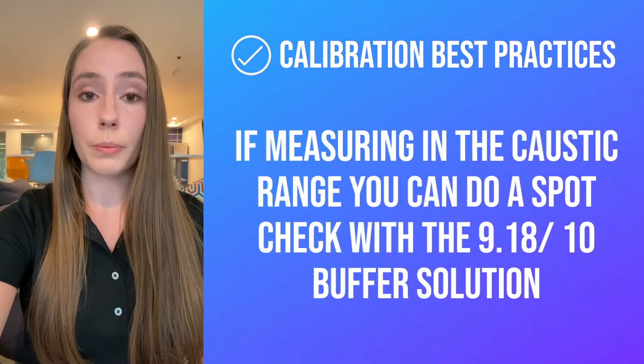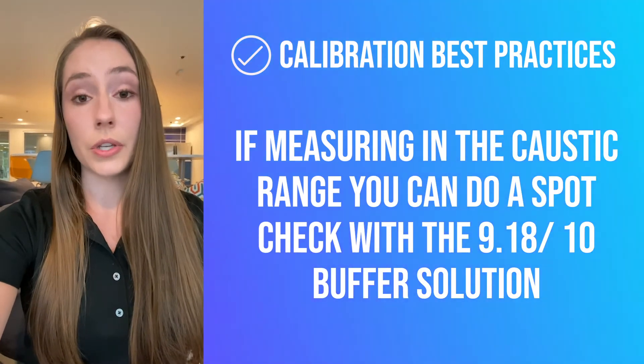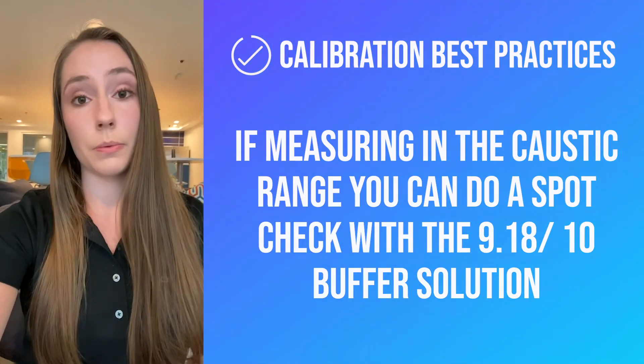However, if your process has a very high pH value, then you can also use the alkaline buffers if you prefer that.